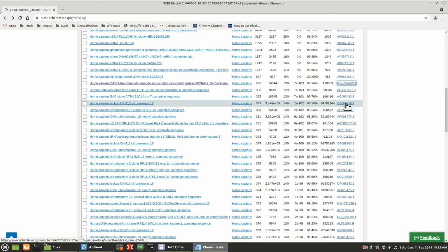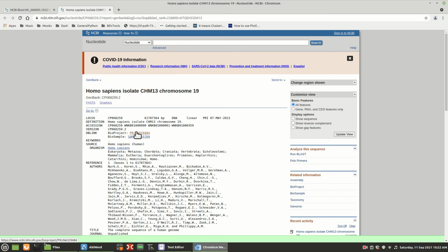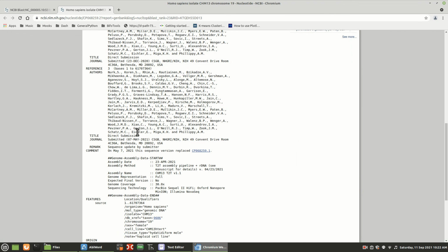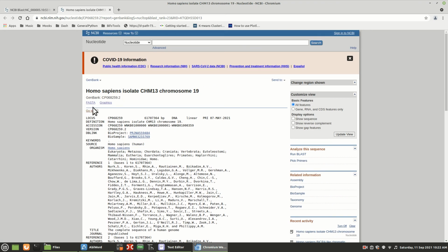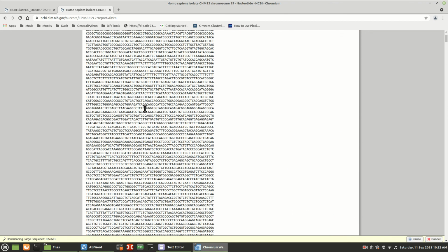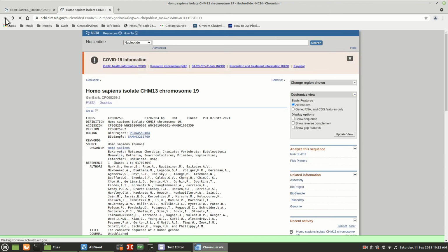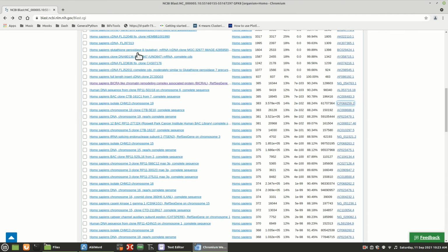Let's see what this looks like. How long is this thing? Let's go to the FASTA. That'll tell us how big it is. Another pretty long one, probably not something we want. It might just be a piece of DNA that includes the GPX gene, so that's not what we're looking for. We want to find something.